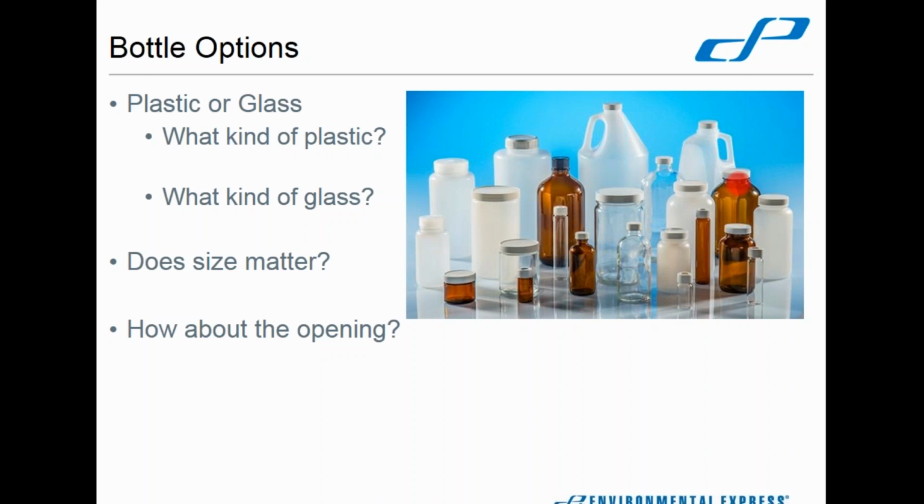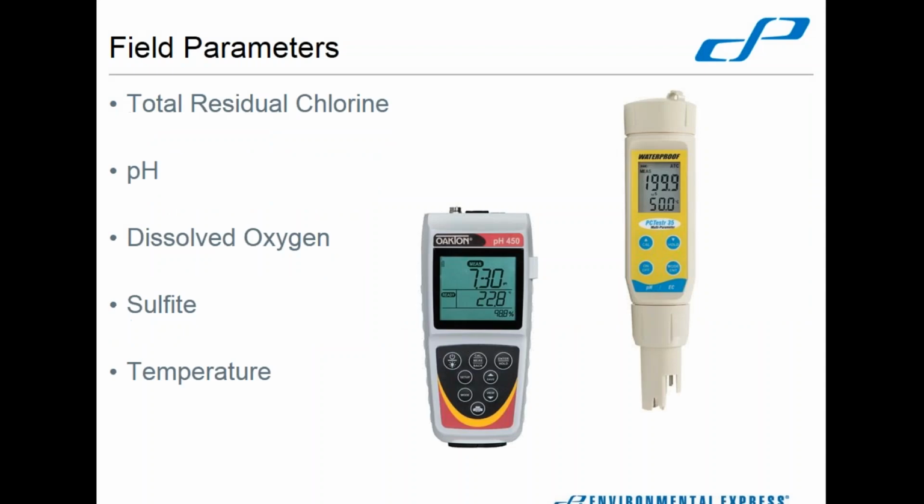So there is no real guidance as far as the regulations are concerned in whether you use a large or a small mouth bottle. It's all up to you as the individual. All right. There are some field parameters that you have to be aware of. I did a quick scan of the holding times, and these are the main ones that I saw.